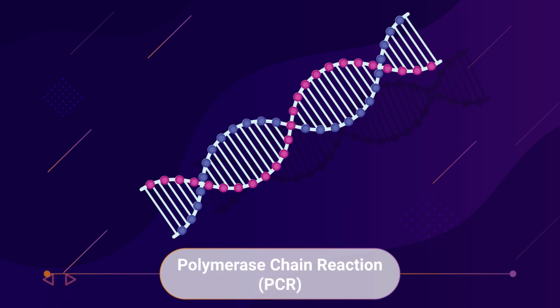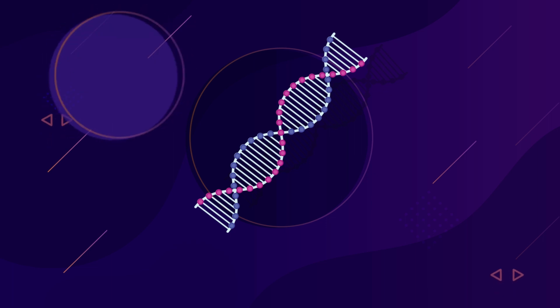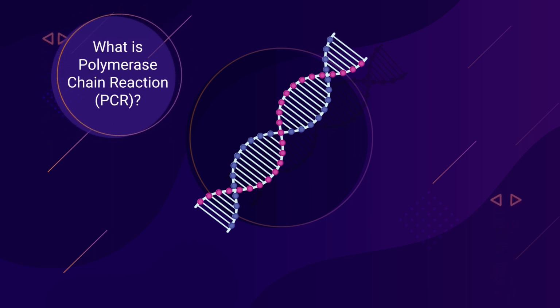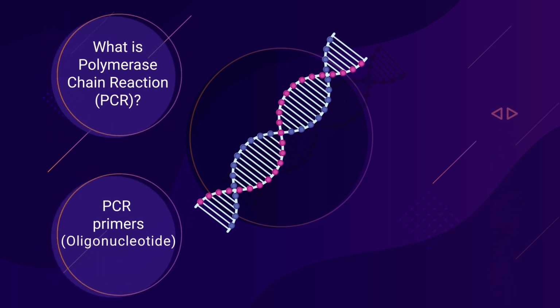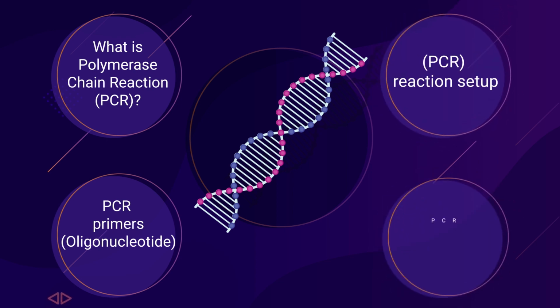Polymerase chain reaction, PCR. In this video we will focus on definition of polymerase chain reaction, PCR primers, oligonucleotide, PCR reaction setup and PCR reaction.